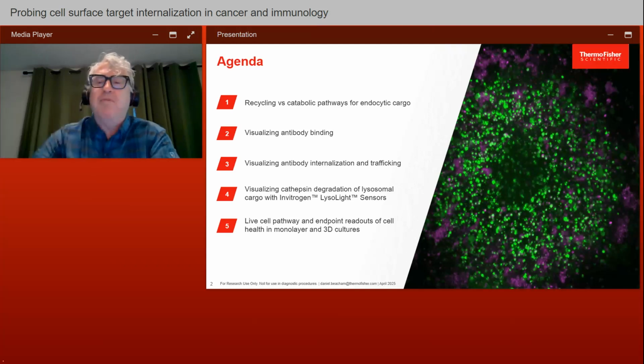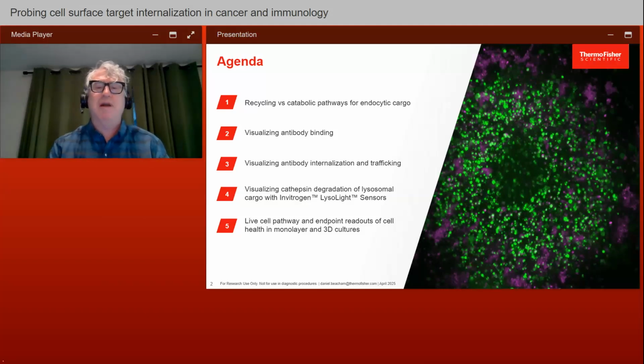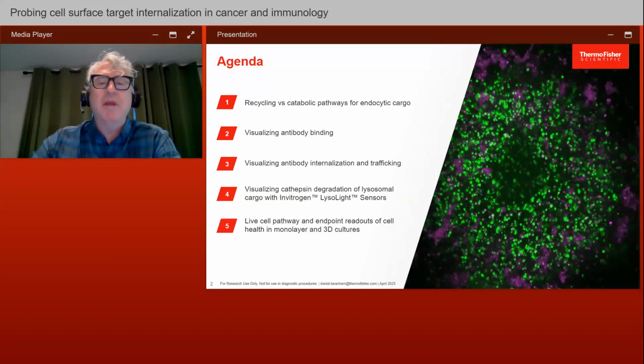I've got a fair amount of technical content for our deck today, and this is something you can always reach out to us offline for as well. We have Salesforce and so forth that can reach right into us in R&D. But here today I'm going to talk about, as promised, some pathways that we like to interrogate for cell surface target internalization and trafficking, and means to visualize those pathways as we've developed in the imaging and fluorescent microscopy space. And again, quantifying those processes.